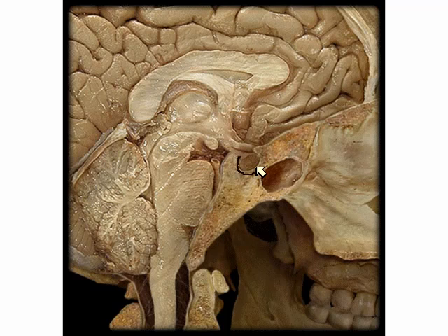Here you see it right here. I believe that means in Latin Turkish saddle, and the pituitary gland sits right in there. So here again you see the pituitary gland. There's a stalk called the pituitary stalk that connects the pituitary gland to the hypothalamus of the brain.